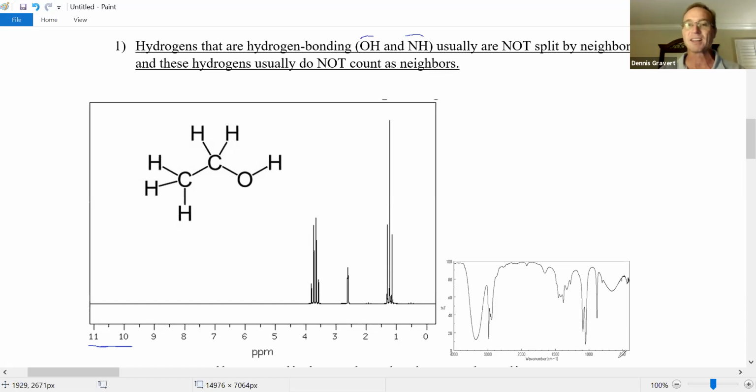It starts on the right, increases to the left, but the scale goes up to 4,000. Carbon NMR also starts on the right, increases to the left, but it goes up to 200. So at a glance at the scale, the x-axis, you should be able to ascertain, is this IR, hydrogen NMR, or carbon NMR? And with the scale of 10, it's hydrogen.